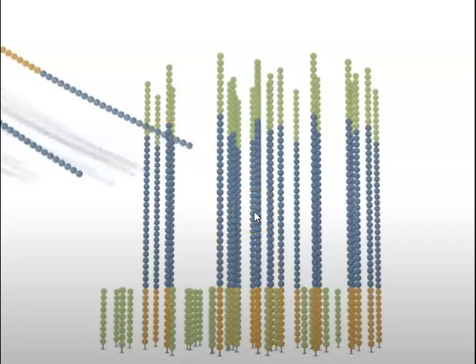So there's no point sequencing sense and antisense at the same time, because you would get C's and G's being flagged up at the same time, and you wouldn't know whether C or G was on the sense or antisense strand. So you cleave off one strand and just leave one single strand attached to the flow cell.